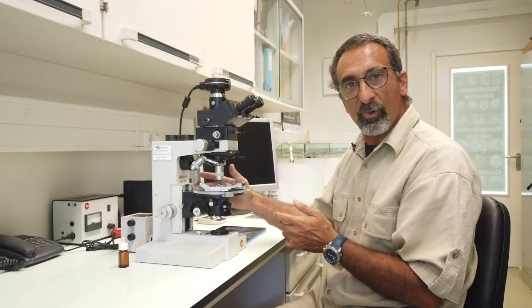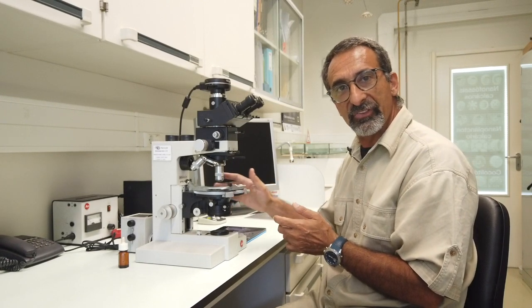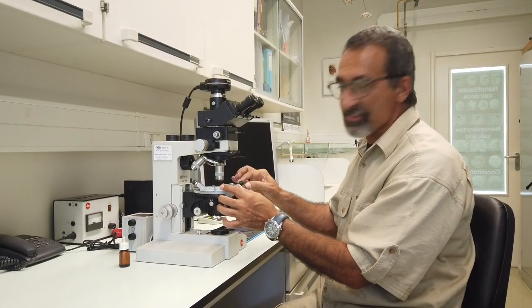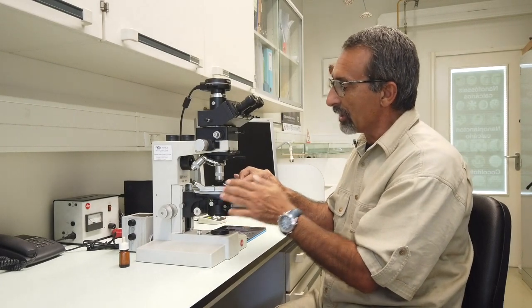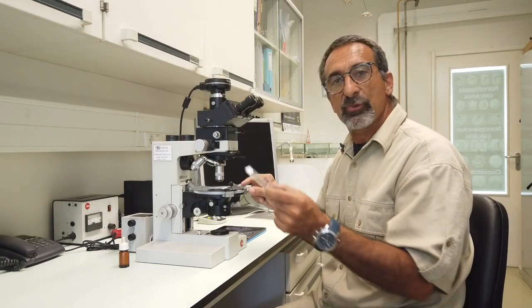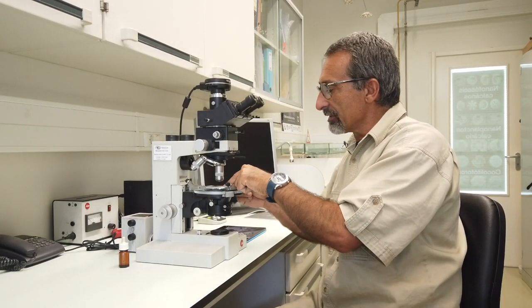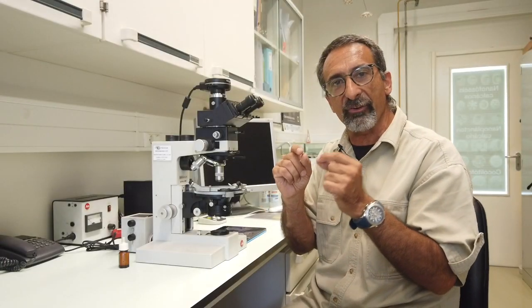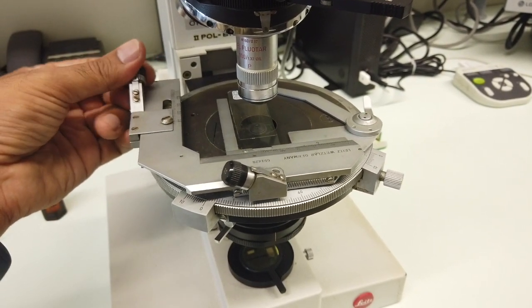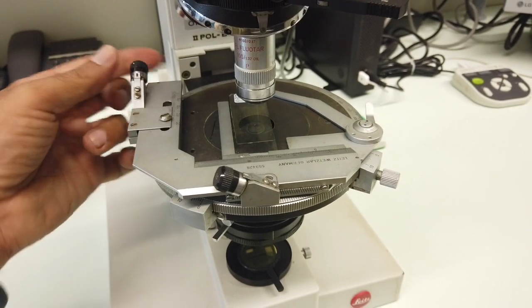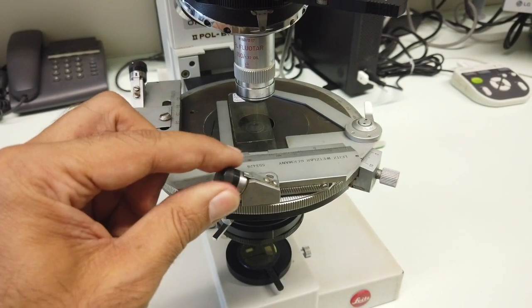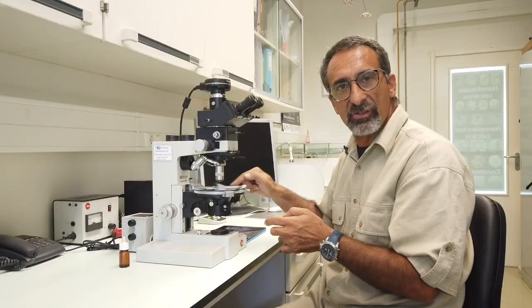This is also very important for our observations as we'll see later on. This rotary stage is also connected to an overstage that is translational according to these two main directions. The overstage allows us to display the slide with our calcareous nanofossils because calcareous nanofossils are so small that we cannot move with our fingers. It would be very easy to lose our objective, our calcareous nanofossils under observation.